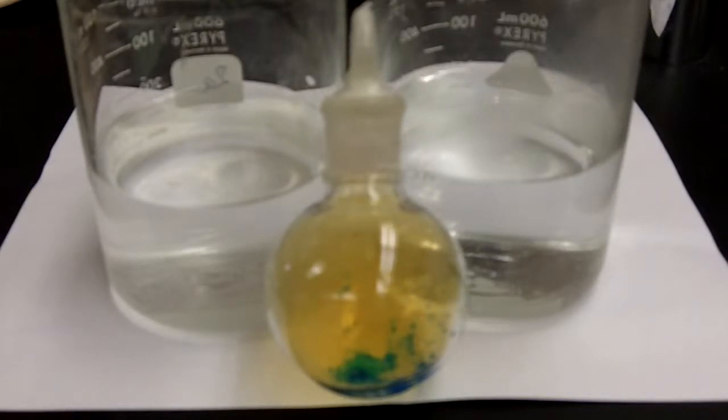You will be taking a small-scale approach to the lab, using small quantities delivered in plastic droppers to minimize waste as well as the impact on the environment. Even the smallest amount of something can affect the delicate balance of its surroundings. The equilibrium equations are as follows. You have equilibrium A with three substances. Noting to the right of that equation, you have colors for two of those three substances, one of them colorless.